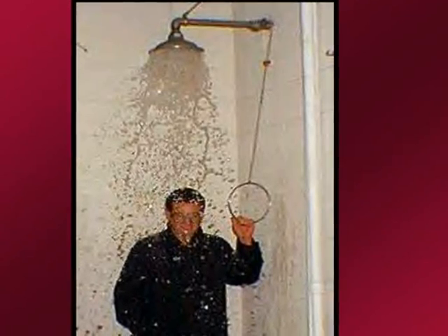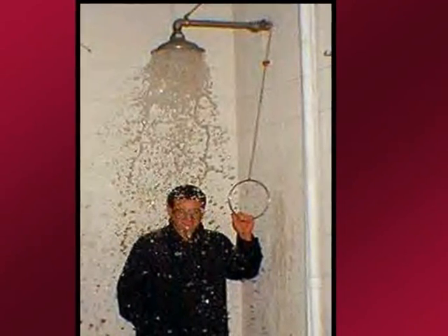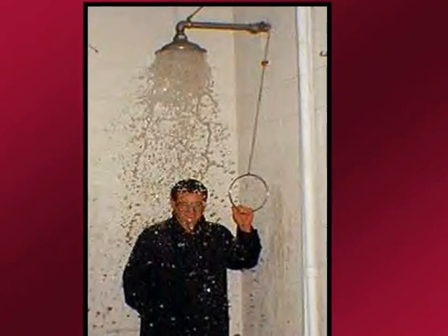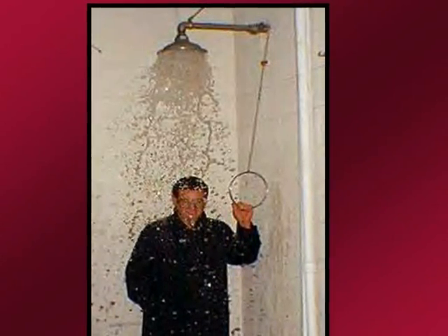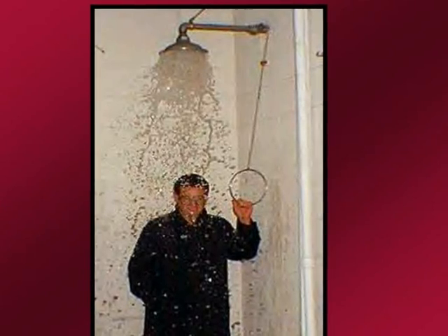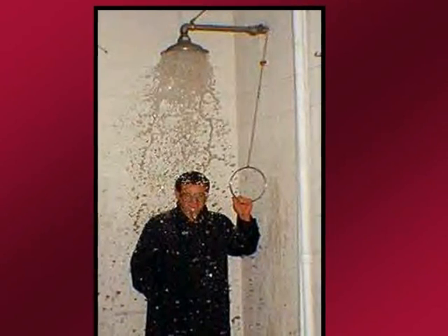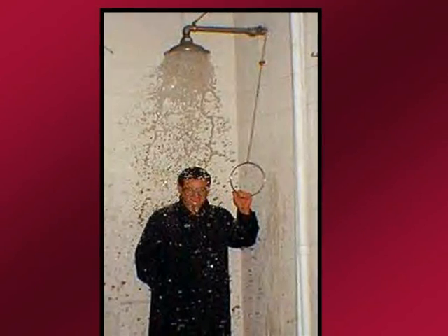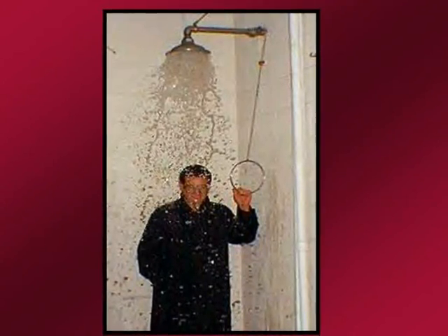The safety shower is not like your bathroom shower. It is a deluge shower, and it is quite cold. It is to be used only in cases of emergencies, and I doubt that you're ever going to need to use it. I've never had a high school student use the safety shower, but I will tell you some stories that I have encountered with college students.